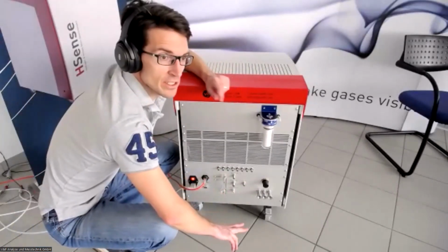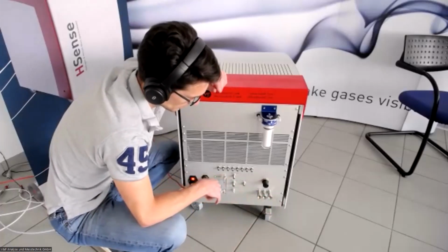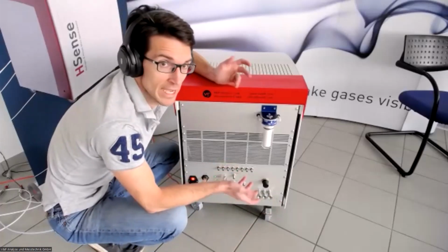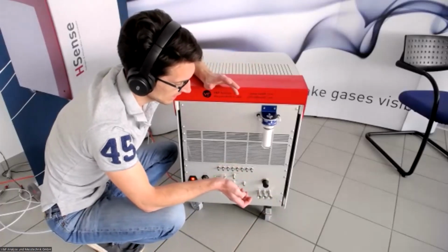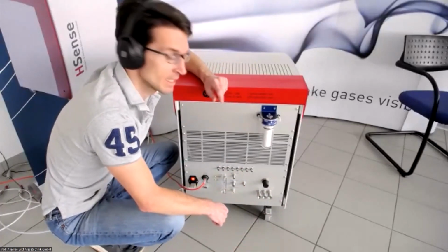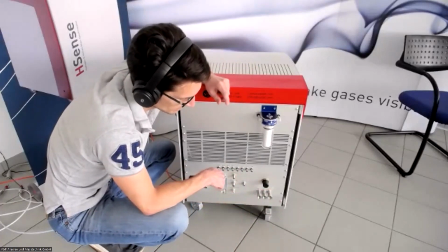Then the last connectors that we have here are the calibration gas inlets. You will usually have your sample gas port connected to your measurement cell, or to your engine, or to your fuel cell. So you need some way to provide the calibration gases without always having to remove the probe from your measurement point. And that's why we have here on the HSense 3 calibration gas inlets.